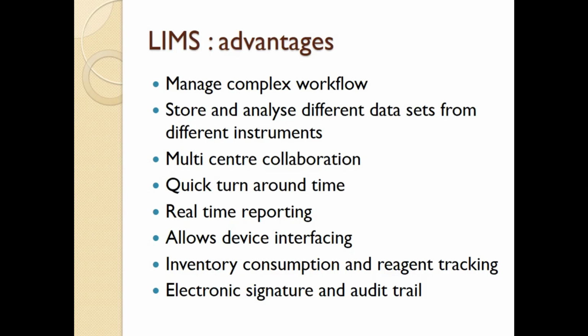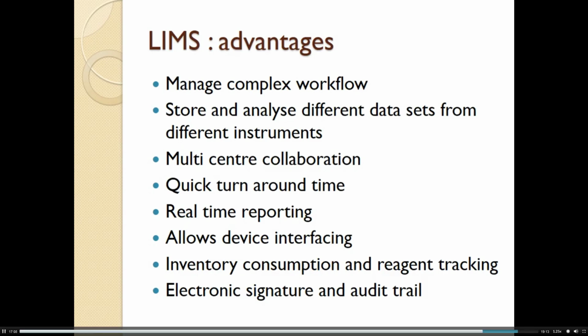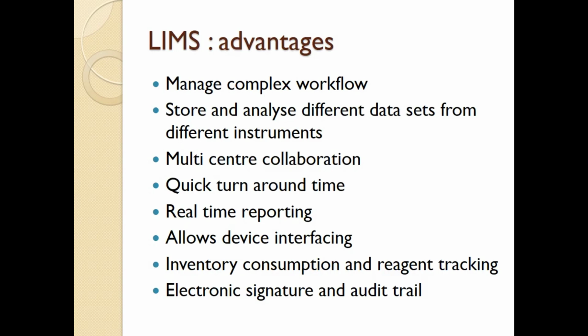Some of the advantages of implementing the LIMS system would be to manage complex workflows, to store and analyze different data sets from different instruments. It promotes multi-center collaboration, quick turnaround time with customized designed reports, real-time reporting, which becomes important, say, for in-process testing or process critical analysis or sterility testing. It allows device interfacing. Inventory consumption and reagent tracking is another important one. So we're more aware then of stock levels. Electronic signature and audit trails, as previously mentioned, are tracked through the LIMS system.